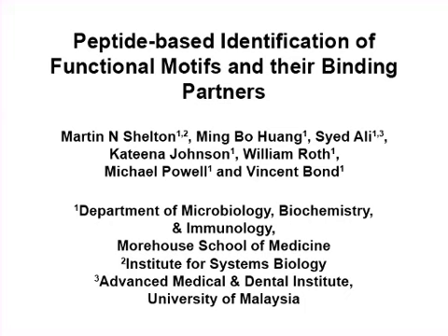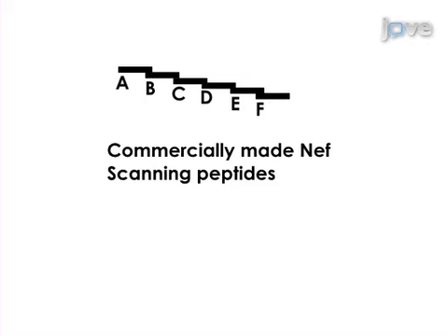This video presents a set of 4 experiments used for identifying functional HIV-1 Nef protein motifs and for developing peptide-based inhibitors. Specific short peptides derived from motifs found in full-length proteins both retain their biological function and competitively inhibit the function of the full-length protein.